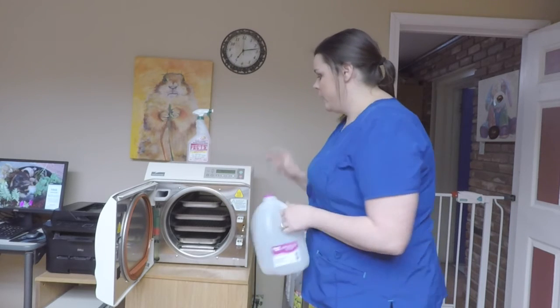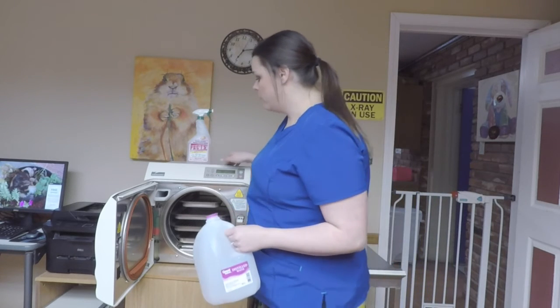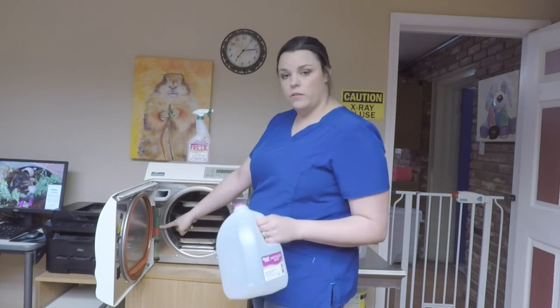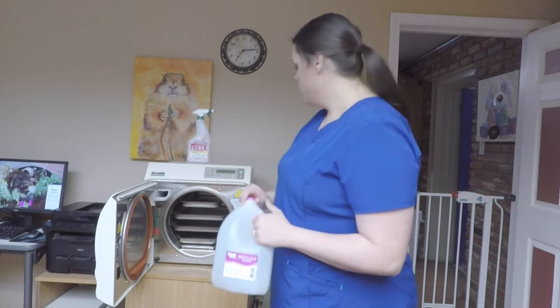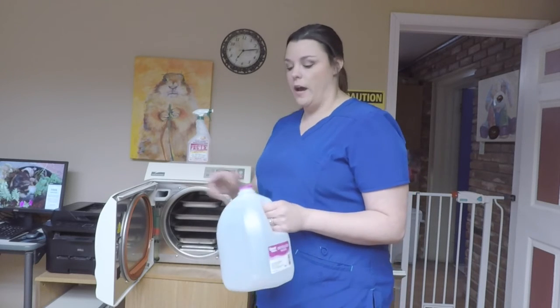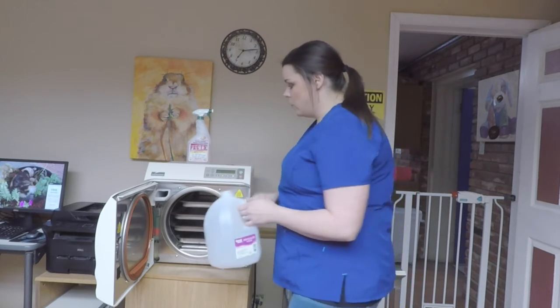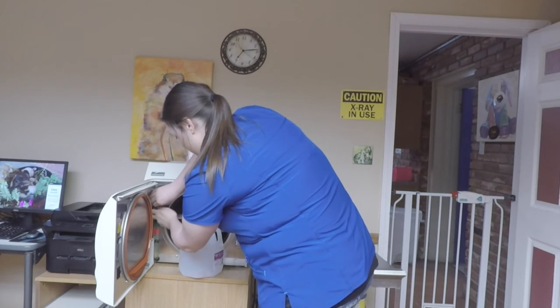The way to add and remove water for the autoclave: if it gets down below the red, or down to the red line, you need to add more water. But each week we empty out the water and change it out. So to empty out the water, you just unhook the hose here.